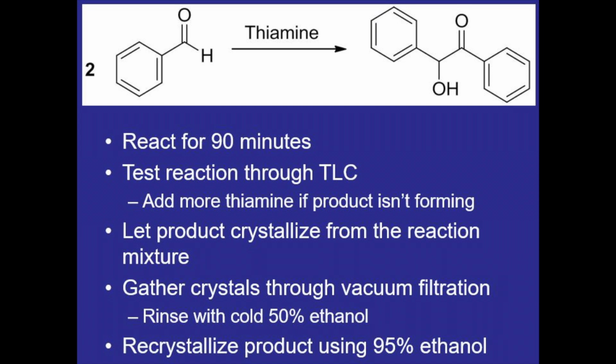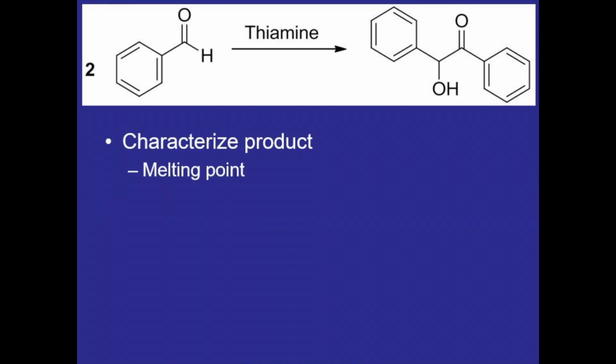Then we'll recrystallize the product using 95% ethanol and characterize that product by taking a melting point and running an IR spec.